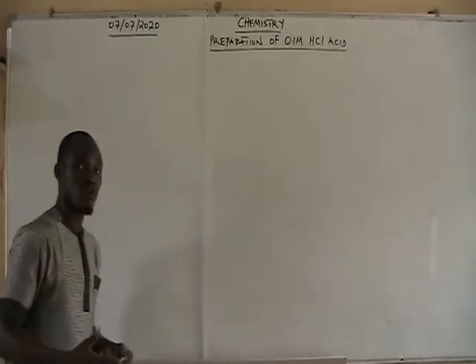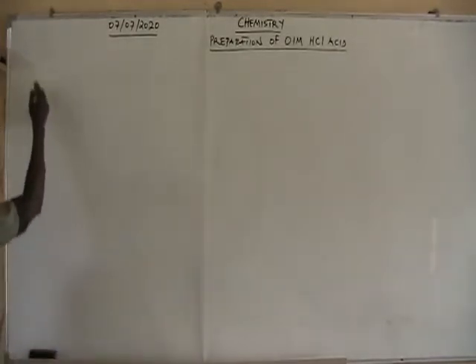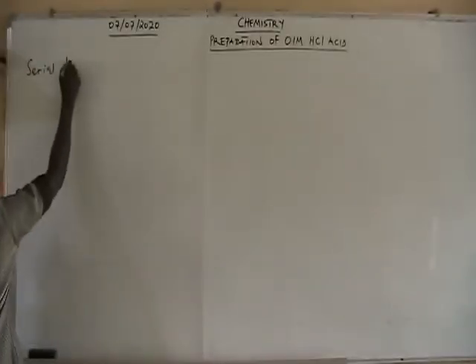First of all, you are going to need the serial dilution formula.